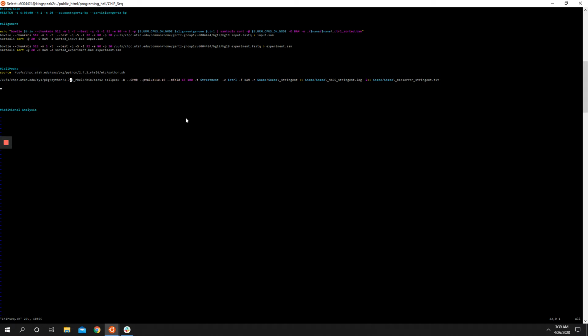Okay, so again, we'll make this an echo. Let's do that same thing here.